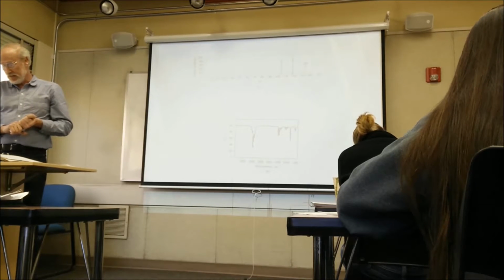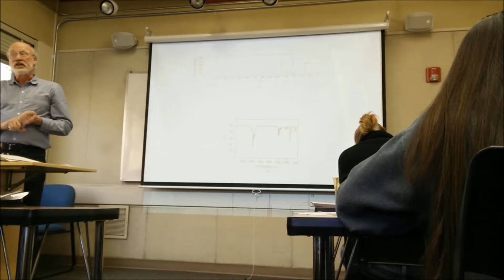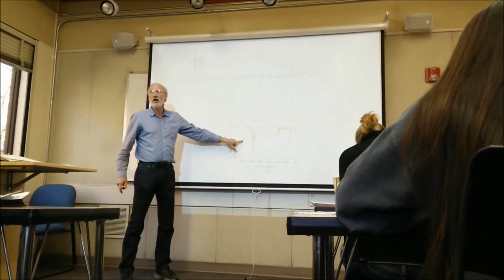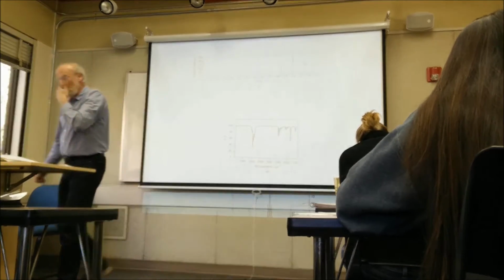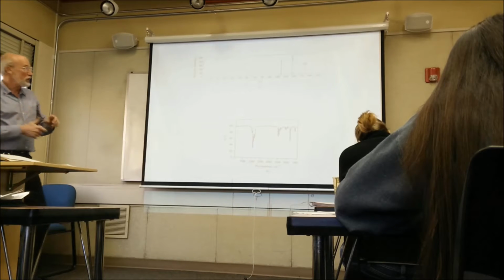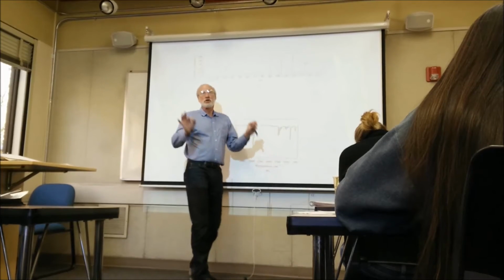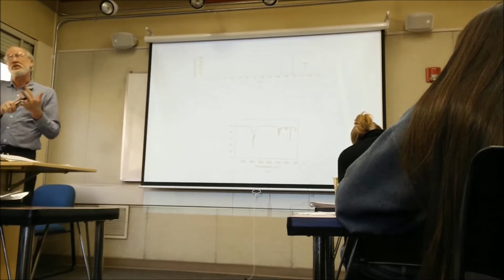If at all. Is there an oxygen in there? If there's an oxygen in there, it's either an alcohol, and we'd see the alcohol peak over here in the IR, and it'd be super obvious. How about if it's an ether? The ether should be in that like 1700. No, the 1700s are C double bond O. So there's no double bonded oxygen, it's not an alcohol, it could be an ether.